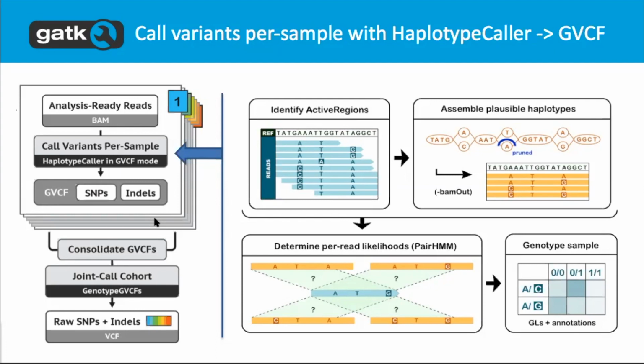It can be evidence of insertion or deletion, or something called soft clips. And when we see that, we're going to say, okay, there's something likely that we want to do here. And so that part of the process is called identifying active regions. And that allows us to focus our energy on those regions and then try to dig more to see what's happening there.